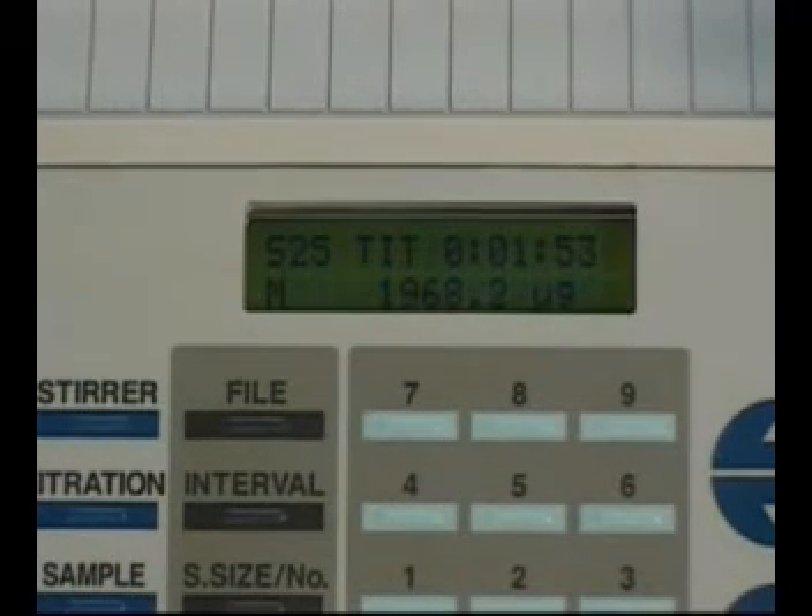Titration gradually reaches the end point and an M mark appears on the screen, indicating that the moisture in the cell is almost titrated. At the end of the titration, an L mark will be shown for 10 seconds, then an alarm will sound.